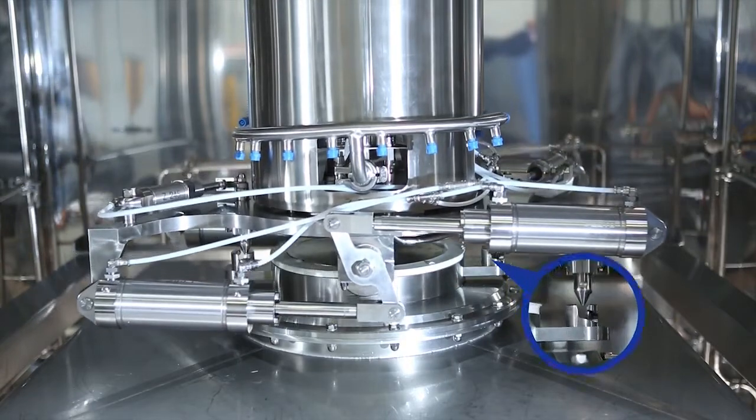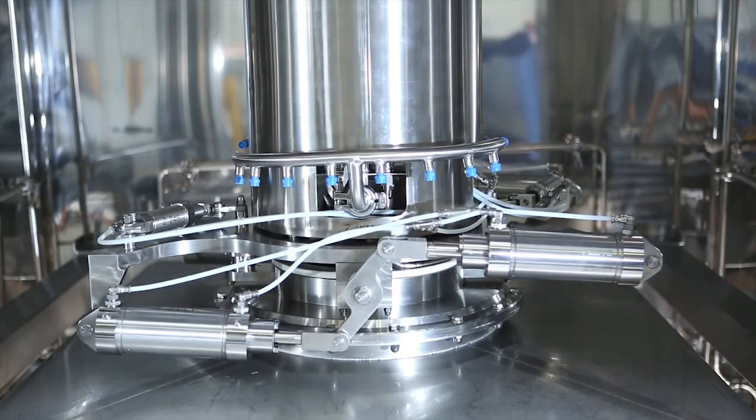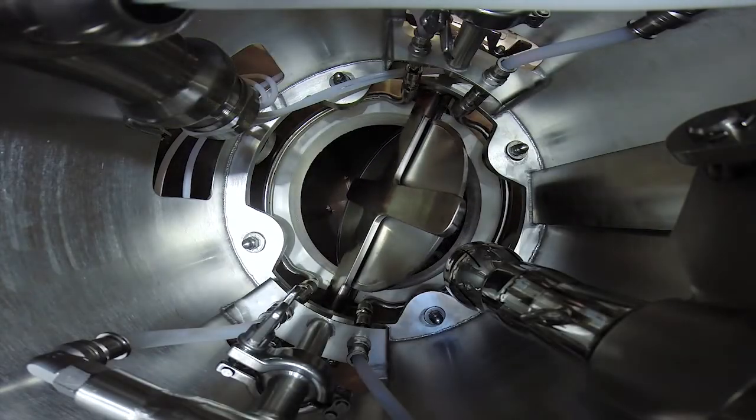After the pairing process, the active part firmly locks with the passive part via two revolvable pins and opens the flap with the help of pneumatic cylinders.